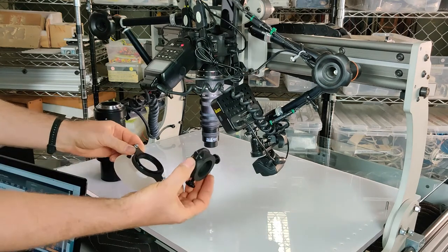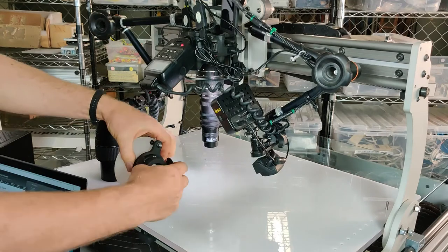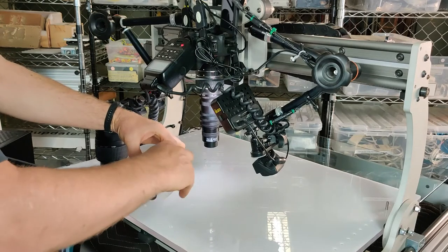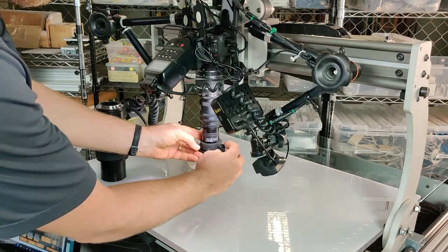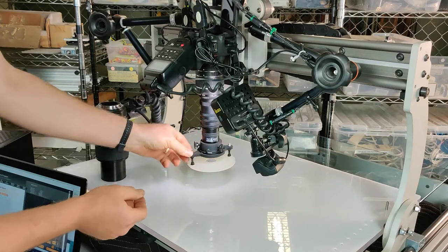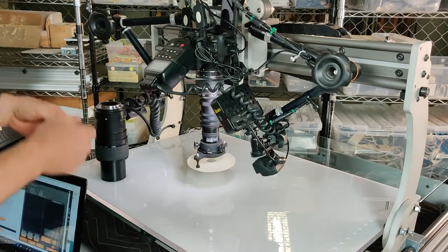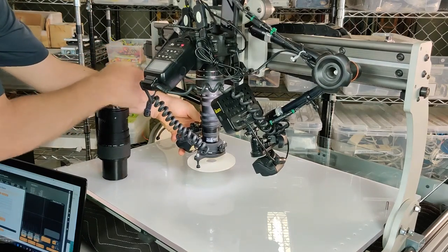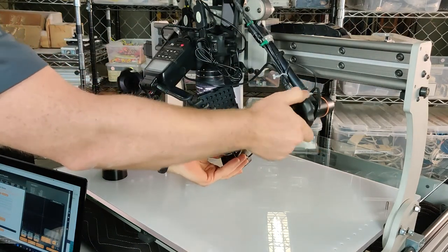The next part is attaching this adapter to my diffuser. Then I will simply attach this to the bottom of the lens and gently snug these adjustment screws. Then I can rotate this diffuser anywhere I want and readjust my lighting to aim down into the diffuser. Like so.